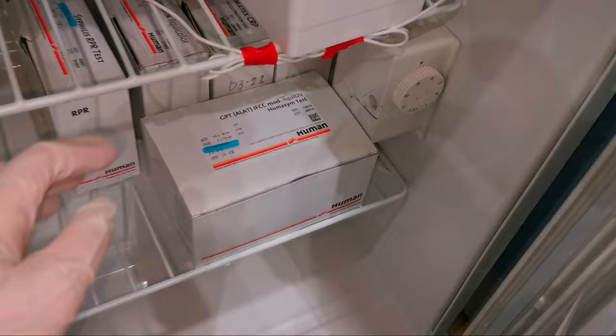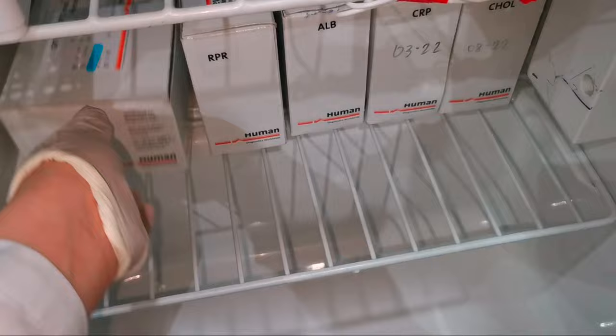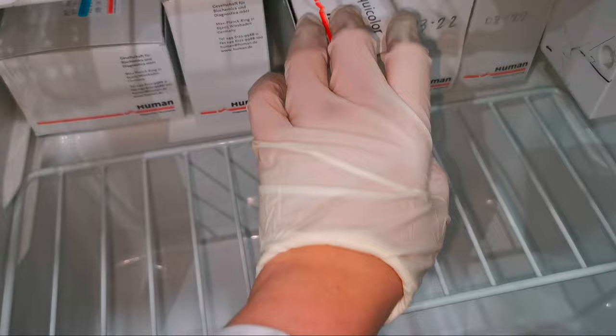Take note that the temperature for storage may vary from one reagent to the other. The ones that we put in the ref are the ones that need lower temperature. You can see the note in the box of the reagent.